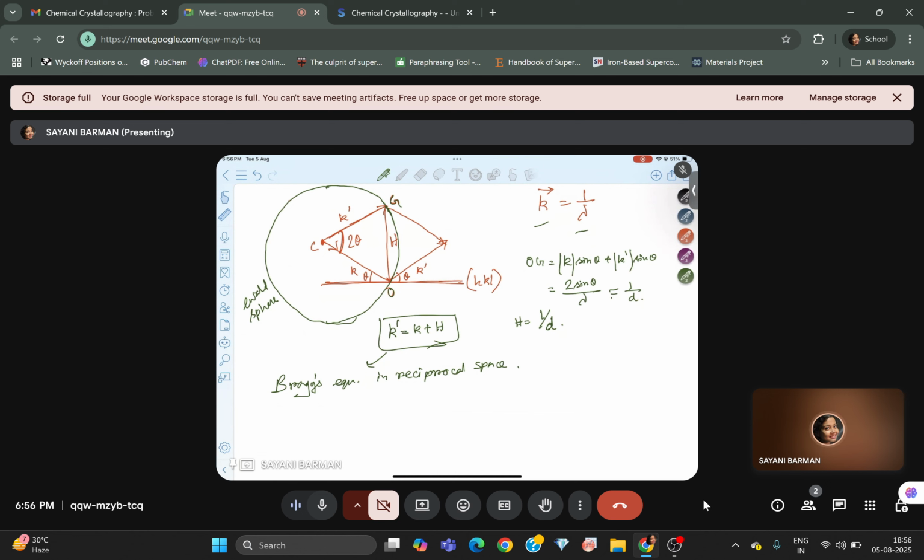Now, there is elastic scattering, as you all know. So the scattered beams are the most intense when parallel or anti-parallel to the incident beam, and weakest when they make a 90-degree angle to the incident beam. Okay. So there are equations related to this field, like the Thomson equation, which is important.